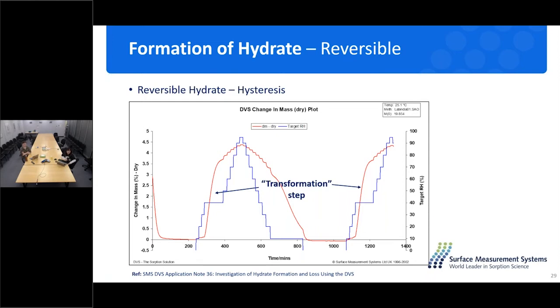And for the structure information, if you have the molecular weight of the sample of interest, we can also calculate how many moles of molecule are hydrated in the structure. So here we have the hydrate of this sample that we performed a water sorption on from 0 to 90% RH with 2 different cycles. And there is a significant increase of the water mass change at a certain level of humidity, which is 40% RH here, which indicates a transformation step with the formation of hydrate.